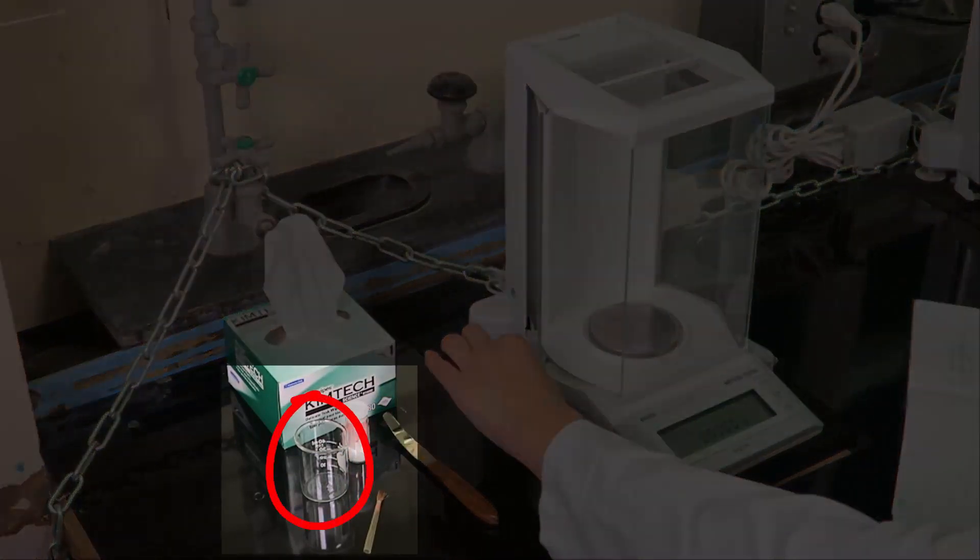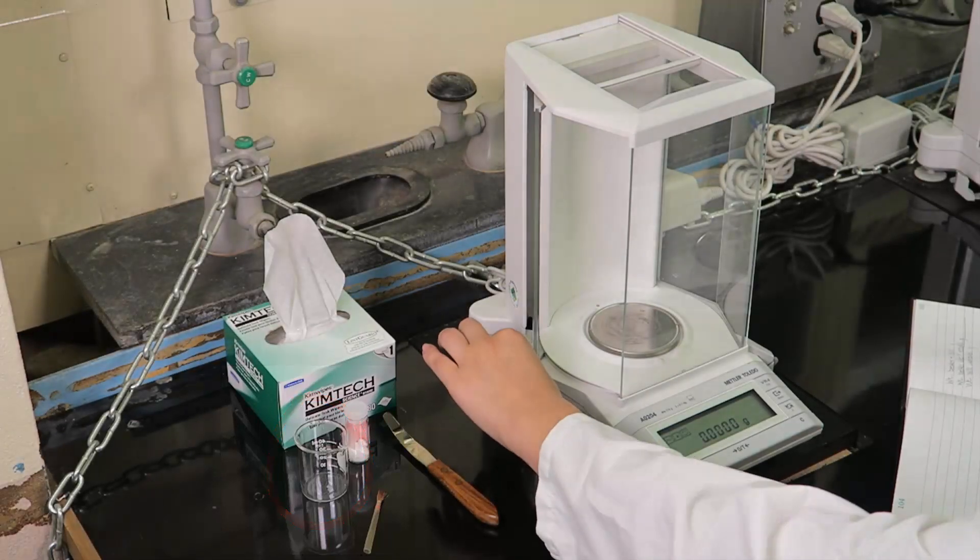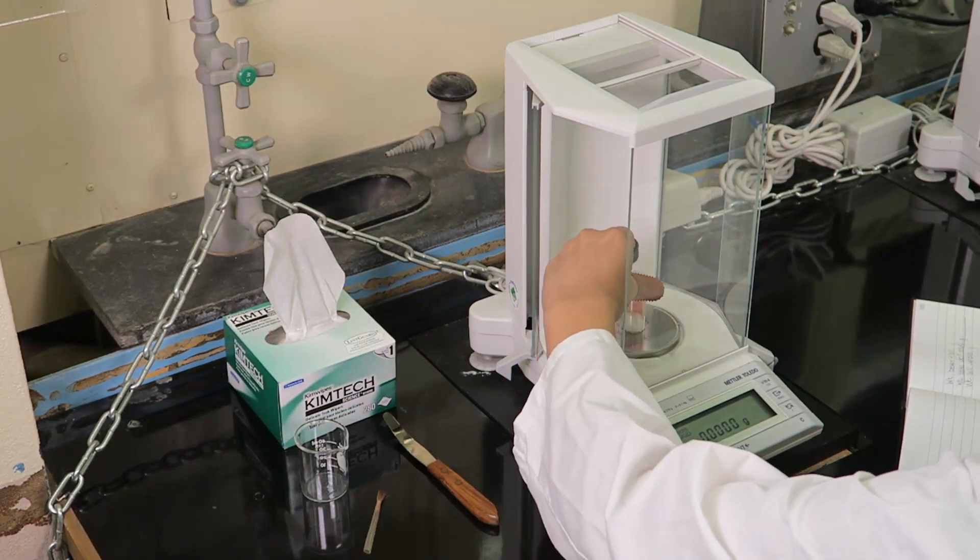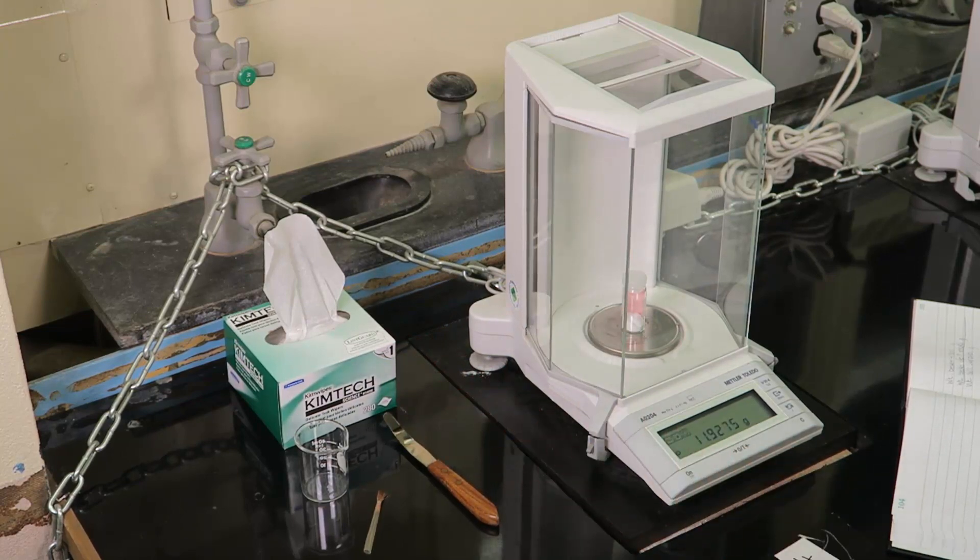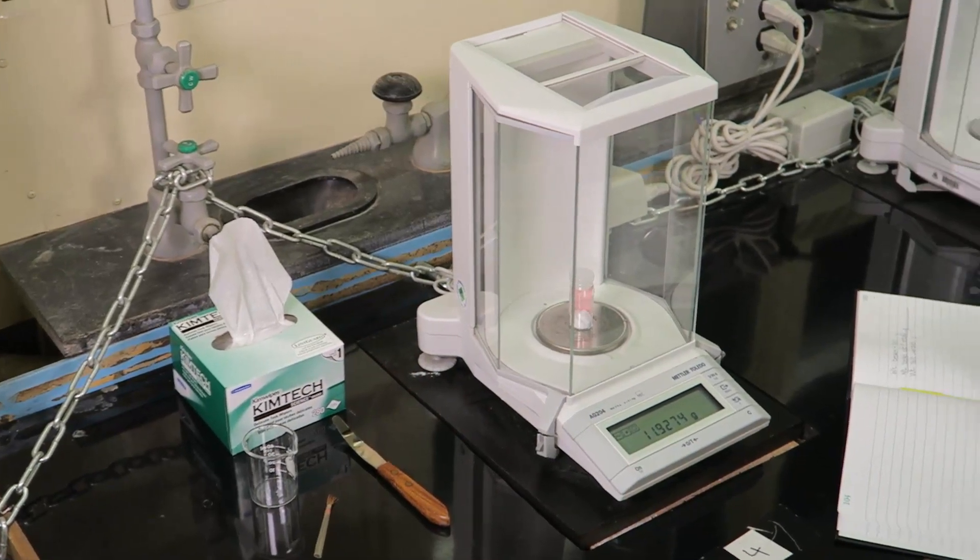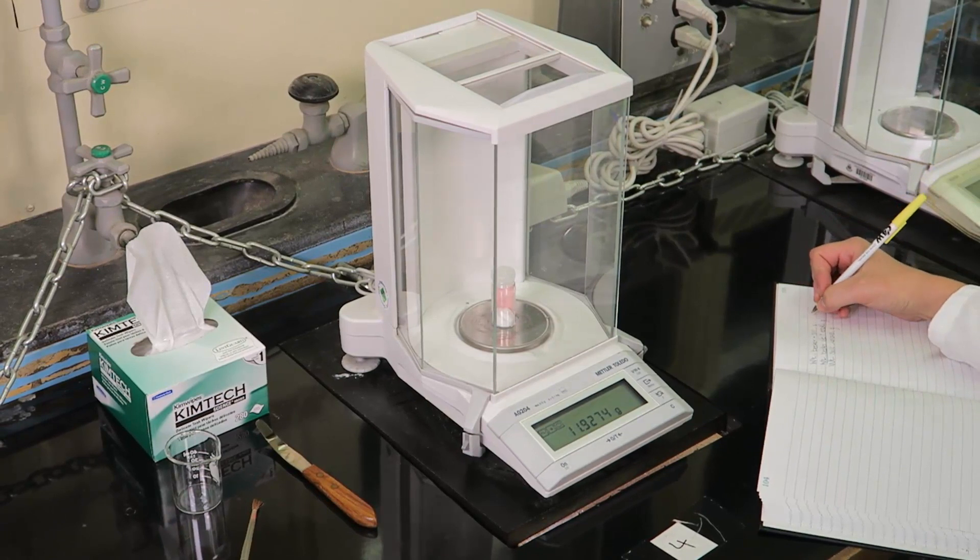Such care does not need to be taken with the beaker since it will not be weighed on the analytical balance or used to accurately determine mass. Place the container onto the center of the balance pan and gently close all the balance doors. Once a stable reading is reached, record the mass in a laboratory notebook.